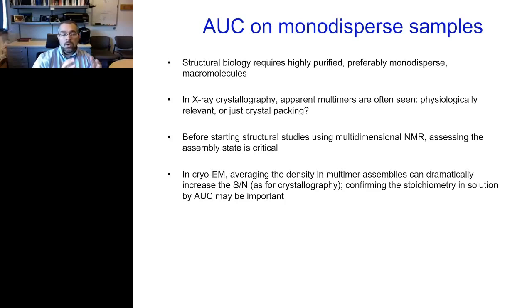So a lot of times we'll see something that looks very interesting in the crystal. We want to verify that in solution and say, well, it looks like a dimer in the crystal. Is that real in solution?